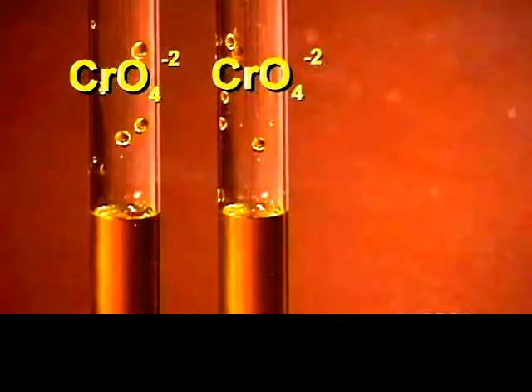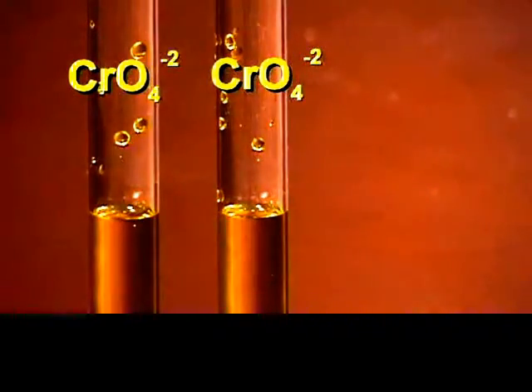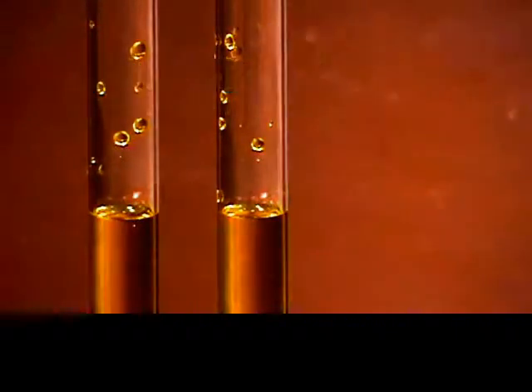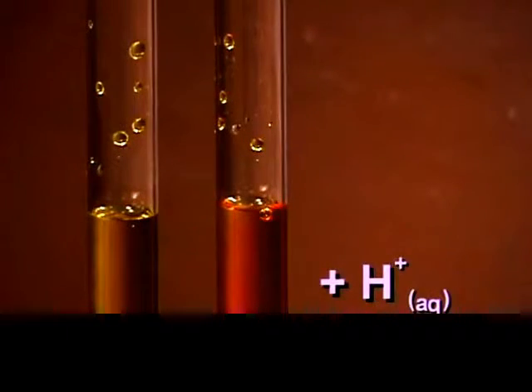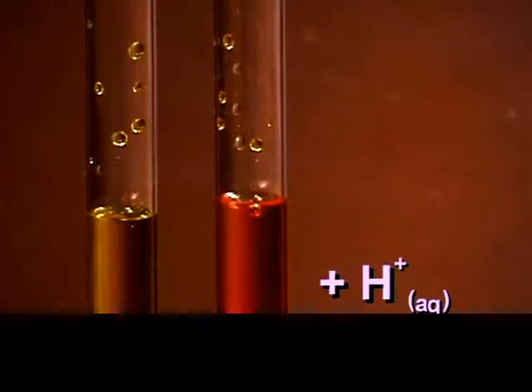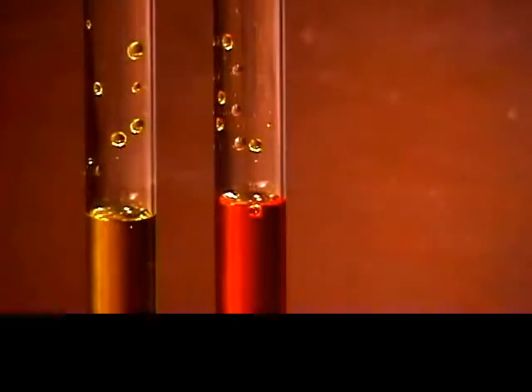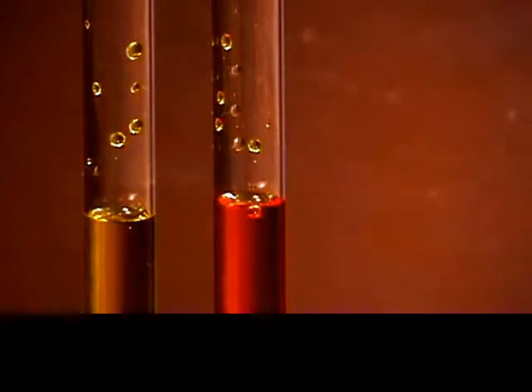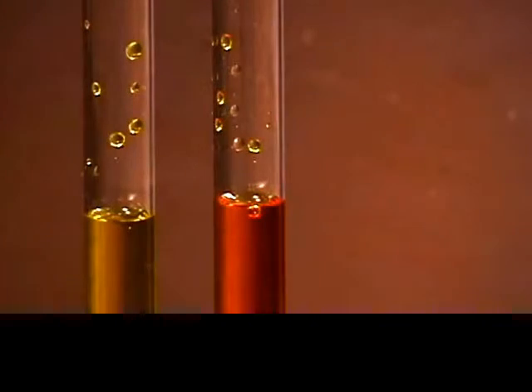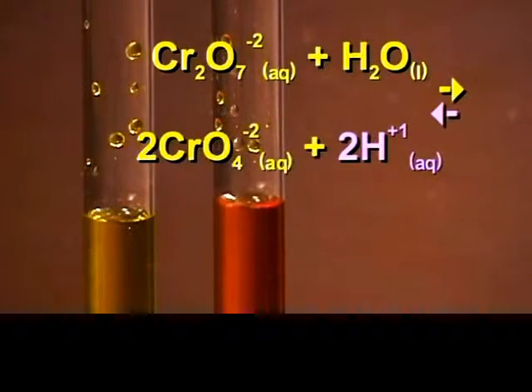We have two test tubes containing a solution of potassium chromate. We will add 6 molar nitric acid to one of the tubes. We notice that the solution turns orange, which indicates that the reaction has shifted in the reverse direction from the chromate to the dichromate.